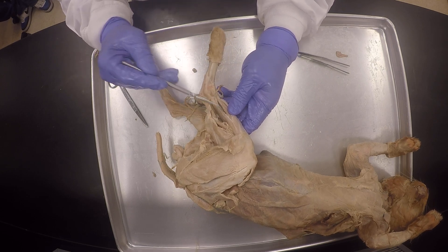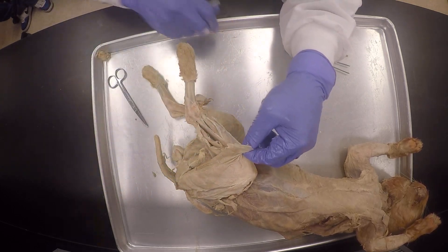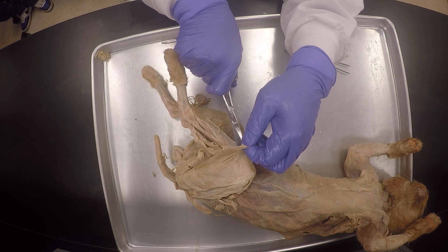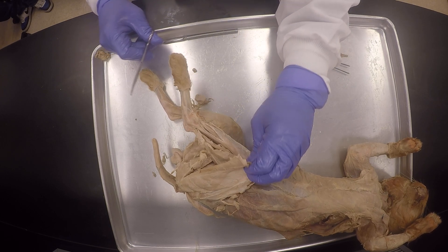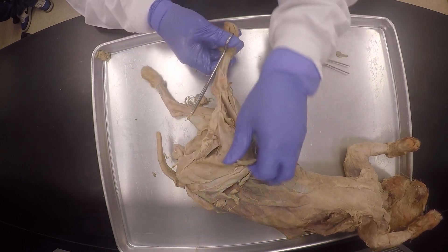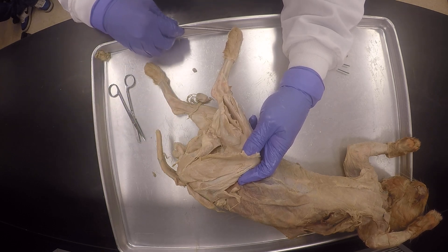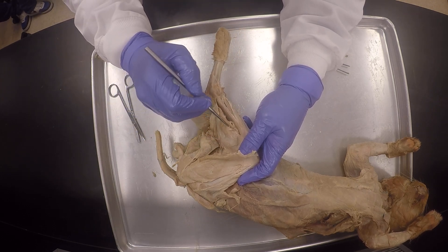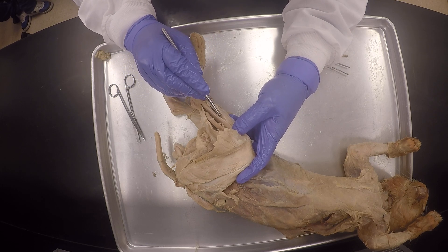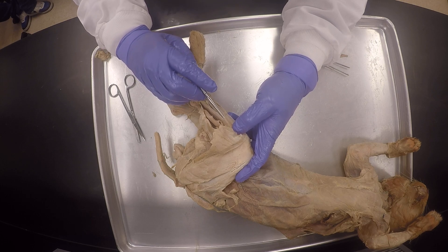So we get here — gastrocnemius, gastrocnemius. So I'm going to pull it off. So this is obviously the biceps femoris from the hamstrings. And then here is the gastrocnemius. And there's the soleus, nicely separated. And there's the peroneus longus, peroneus longus. You've got to be real careful now when you do this.